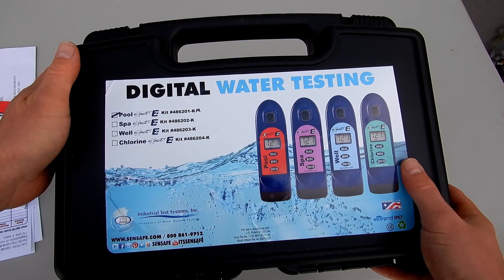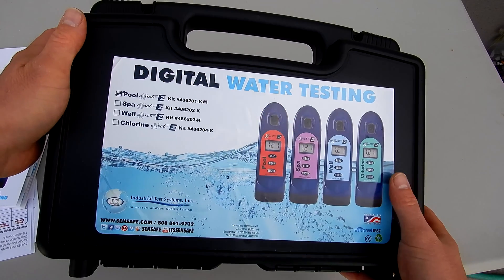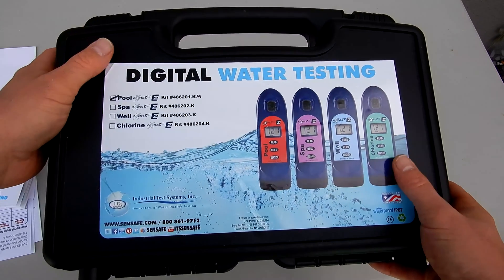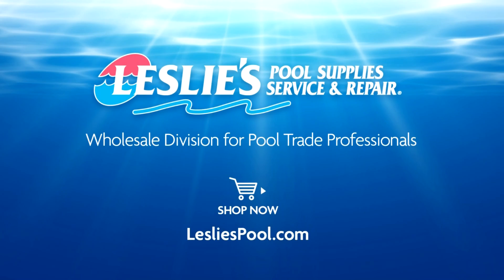The Pool EXACT EZ Photometer Master Kit would be the perfect kit for your pool route. It's also NSF certified, so it's perfect for commercial pool use. Leslie's Pool Supplies has been do-it-yourselfers and pool trade professionals' trusted partner since 1963, providing quality products and services to make pool care easy, and solutions and expertise to do it right.